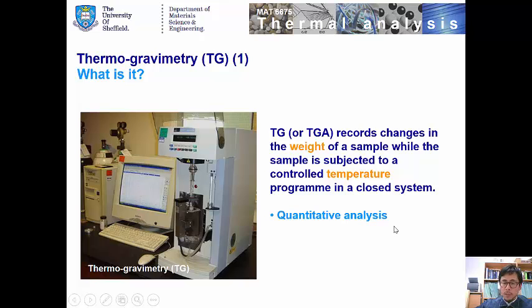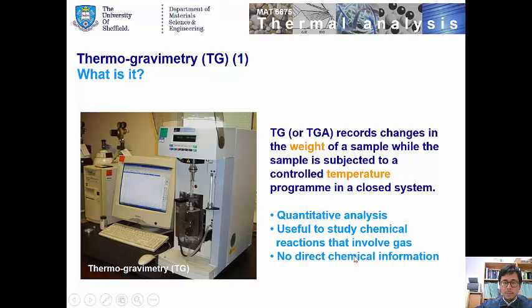The analysis is very quantitative, and this is a technique very useful to study processes that involve gas. Important thing to remember, however, is this is information only related to the weight of the sample. Therefore, it does not provide any chemical information directly.